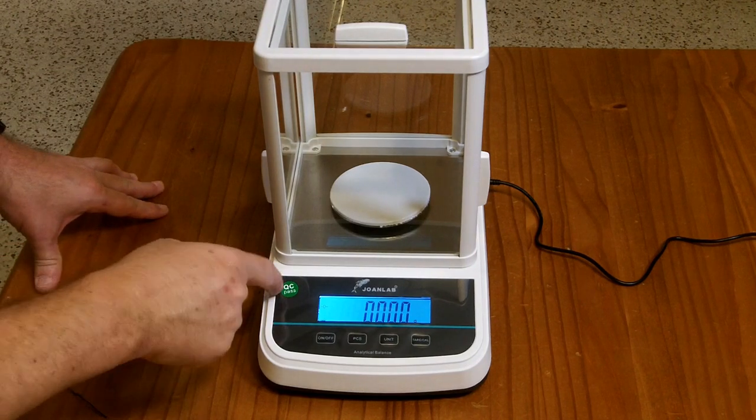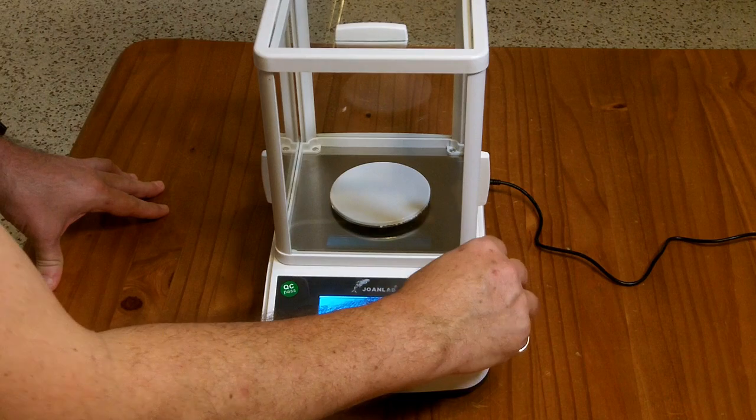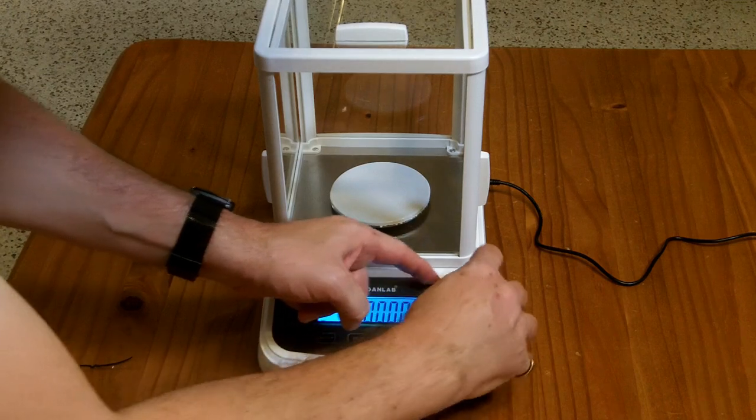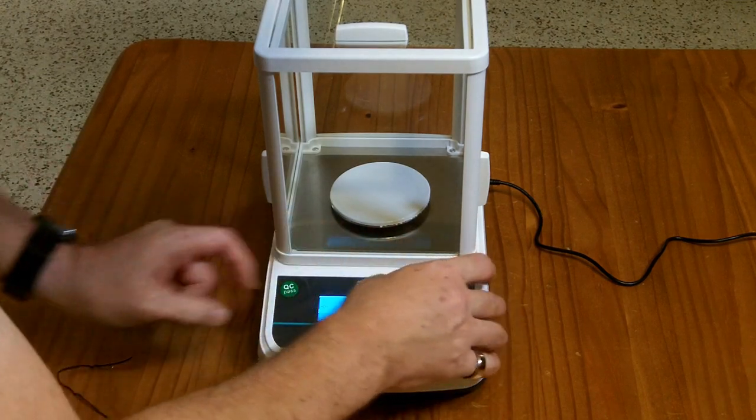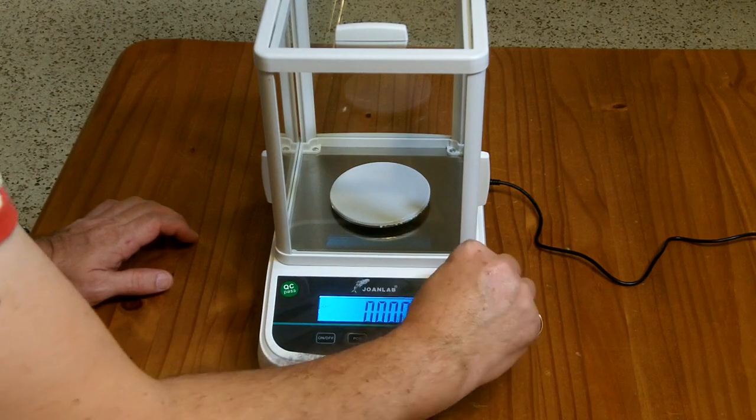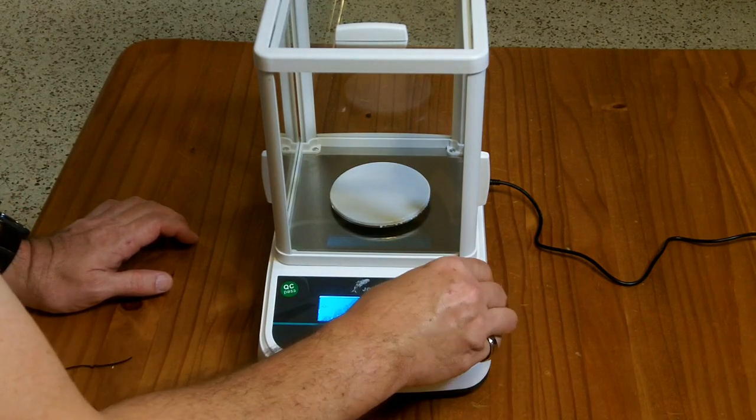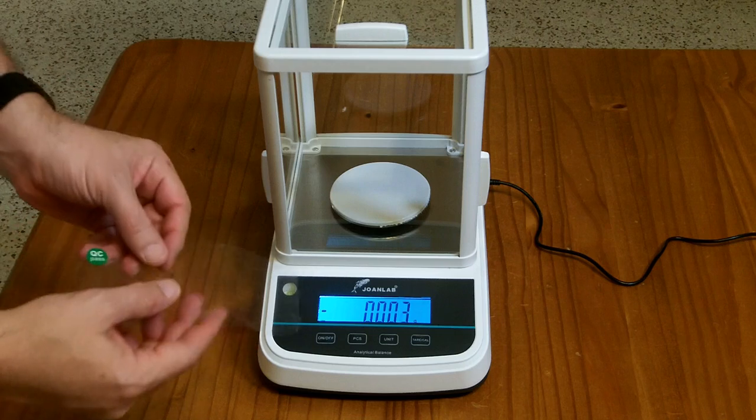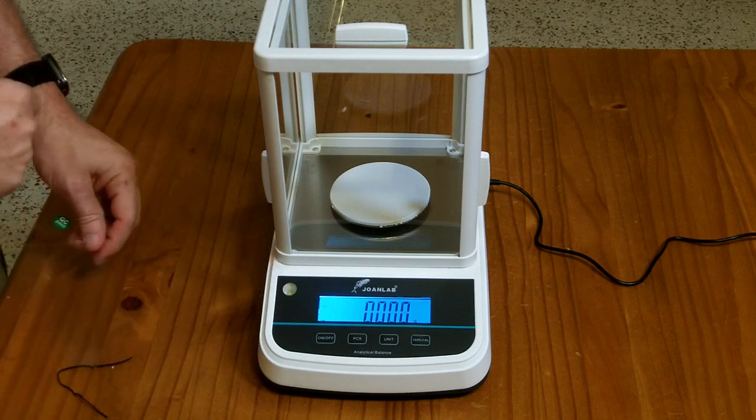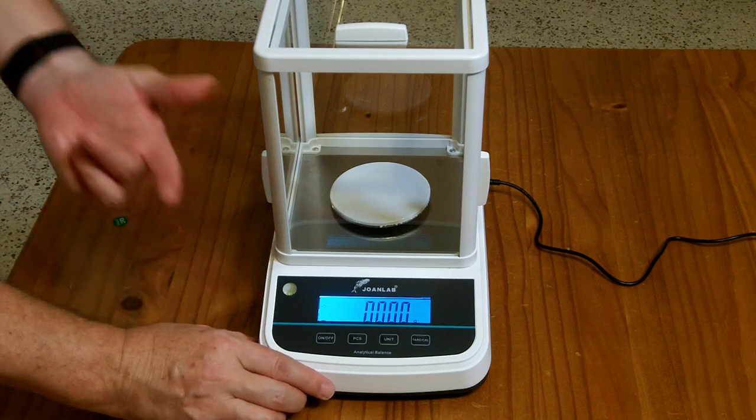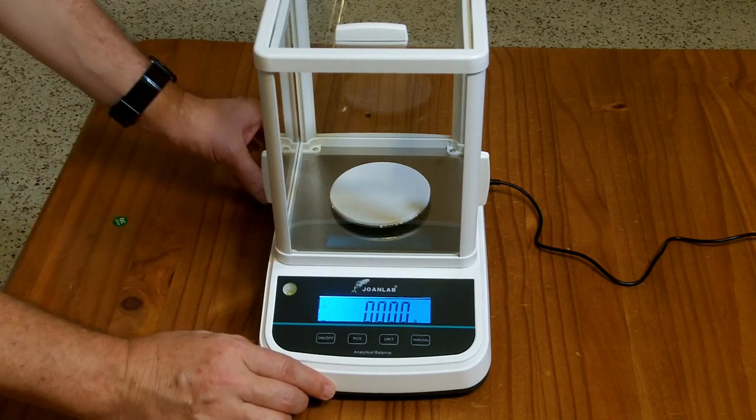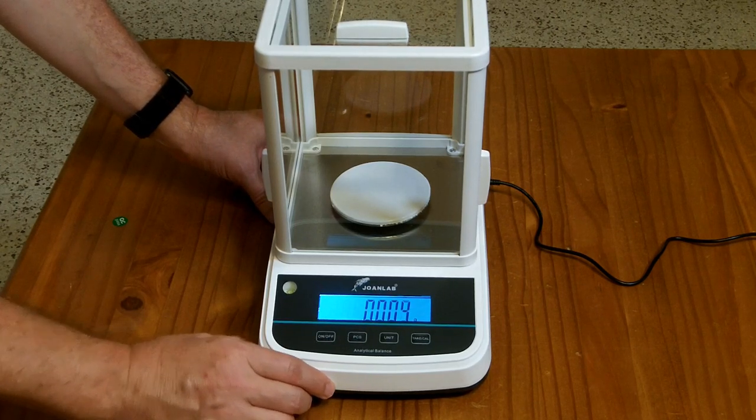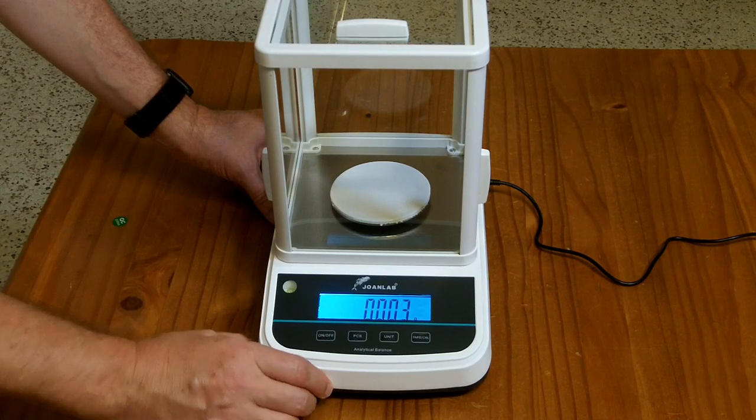Now it does appear that there's a QC pass sticker and I think that's on top of a protective film here. I believe this is a protective film that you're supposed to remove. It has a wrinkle in it. So I'm pretty sure it's not just part of this scale, but there's not like an easy to grasp. There we go. So there's the protective film. And underneath the protective film, underneath the QC sticker is this bubble level. So I haven't actually leveled it, but my table happens to be pretty level.